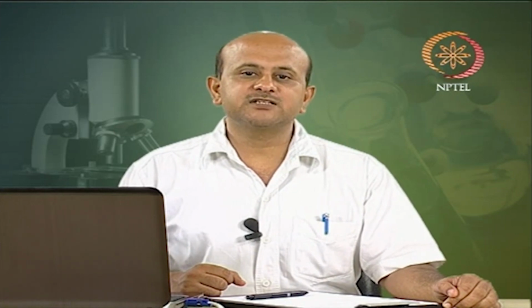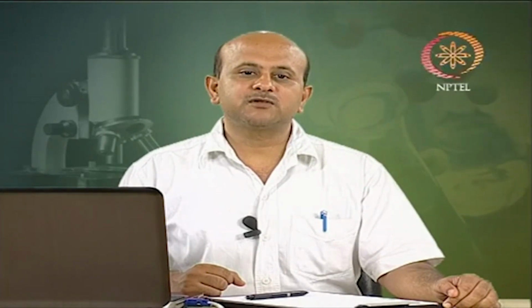Now, electrospray ionization or ESI. A more physical explanation of ESI is that needle voltage produces an electrical gradient on the fluid, which separates the charge at the surface. This forces the liquid to emerge from the needle as a cone. The tip of the cone protrudes as a filament until the liquid reaches the Rayleigh limit, where the surface tension and electrostatic repulsions are equal and the highly charged droplets leave the filament. So, that is one way, that is a kind of spray.